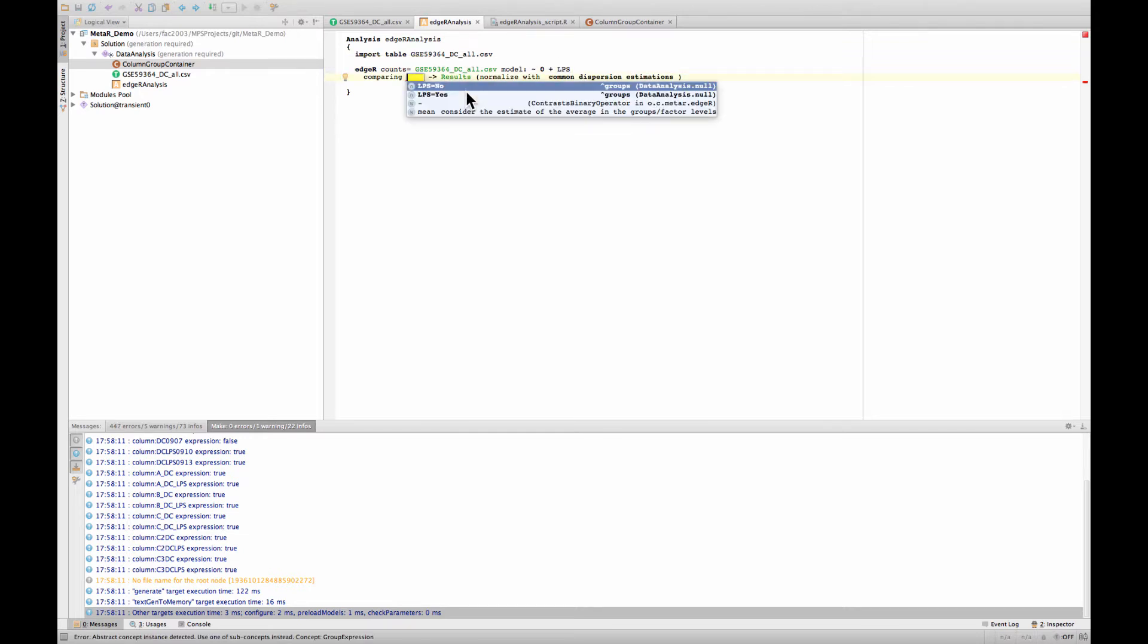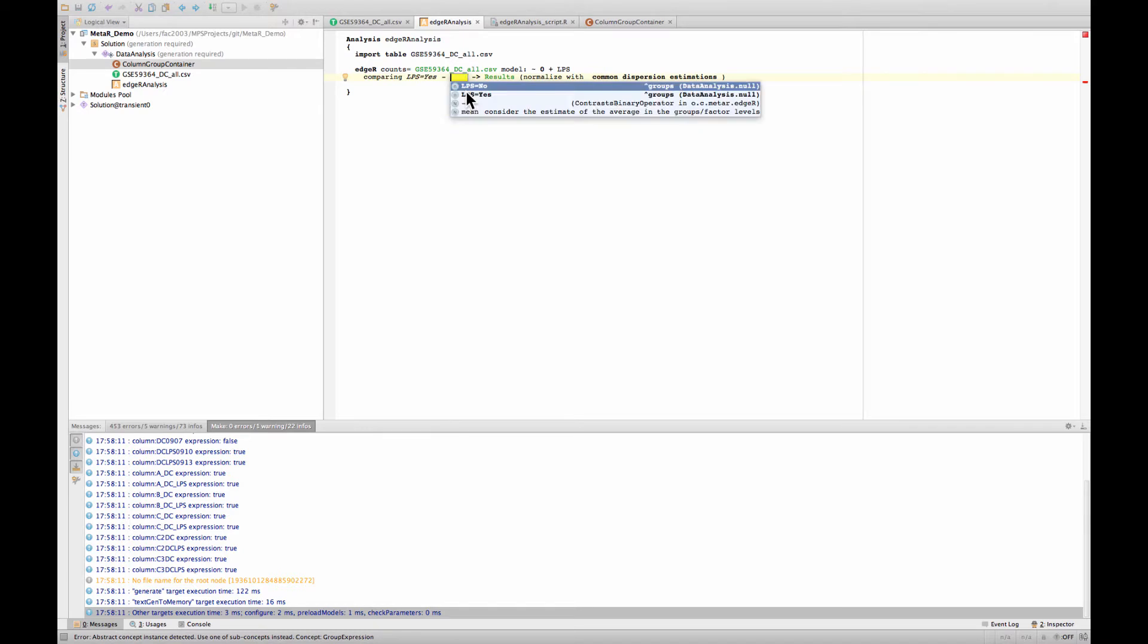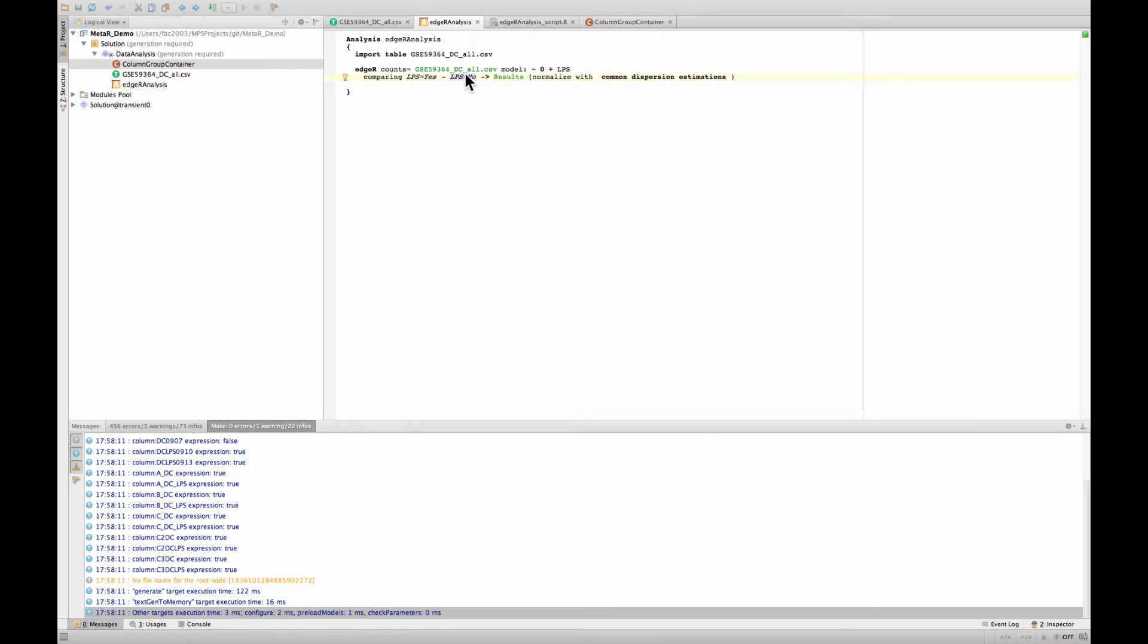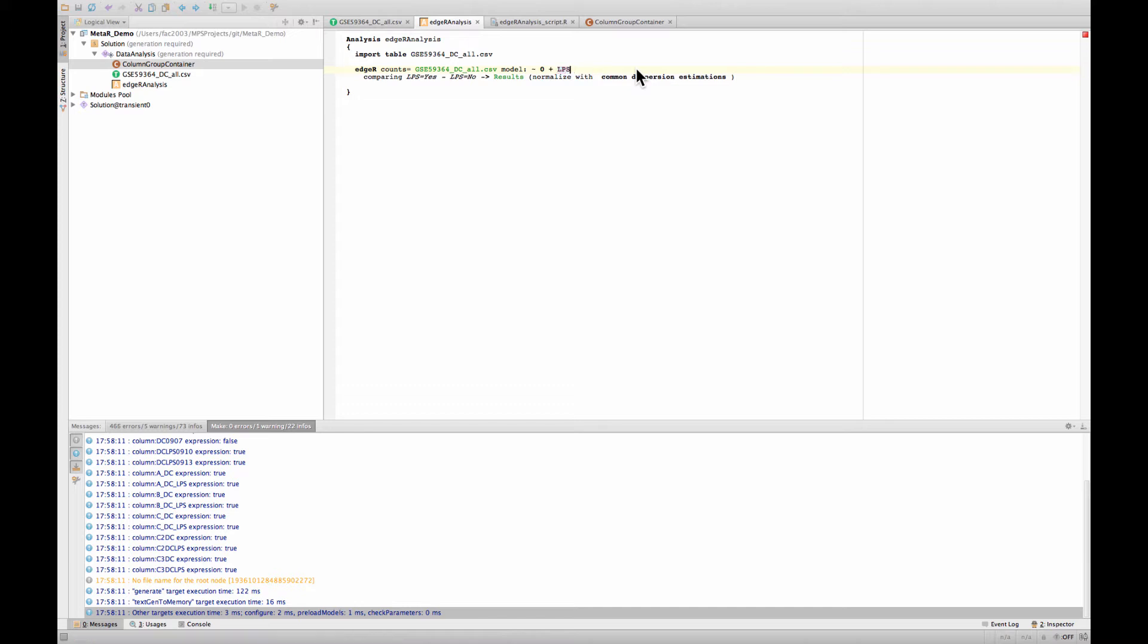And now we will compare LPS yes, so the average value of samples that have LPS equal yes, minus the average of the LPS no samples. And this is a statistic that we will actually compare to zero. This is the test that we will implement with edgeR. And you could of course if you had defined more factors, you could add to this model and list those additional factors. But here we have a very simple model.